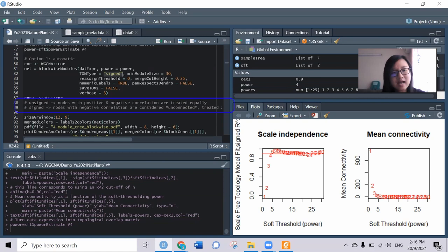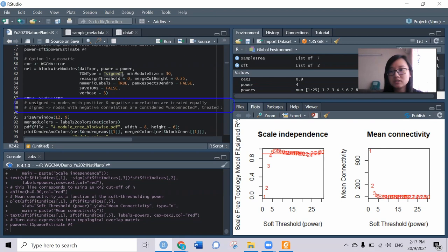In general, unsigned means we treat nodes with positive and negative correlations equally - they both express that they have correlation. But signed means we will ignore nodes with negative correlations. We only focus on positive correlations. It depends on your objective to decide which type you prefer.